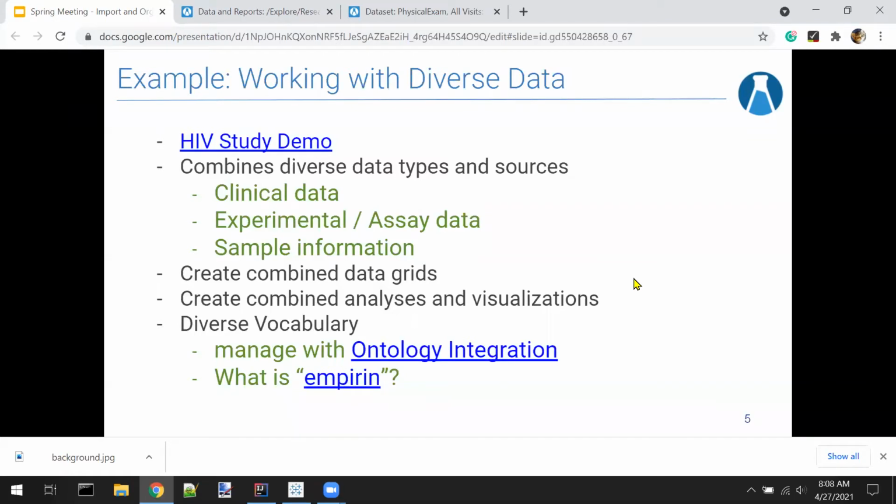And then at the time they are comfortable with the data, after they've done their QC steps and they've reviewed and they feel confident in their results, they can then copy to study, meaning they will basically create what's called an assay data set from the assay. So in some ways, it's the best of both worlds.